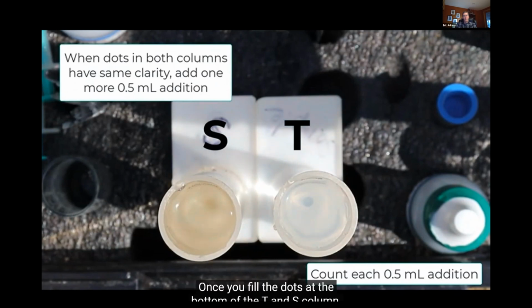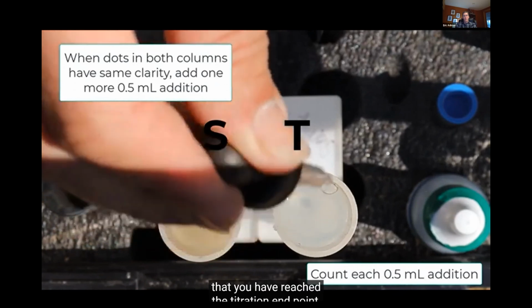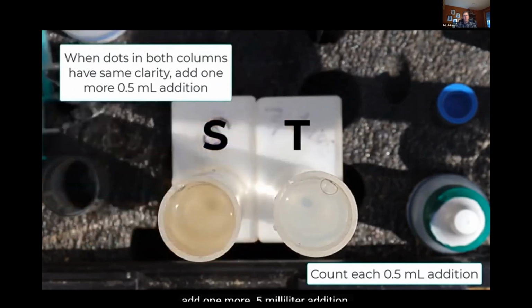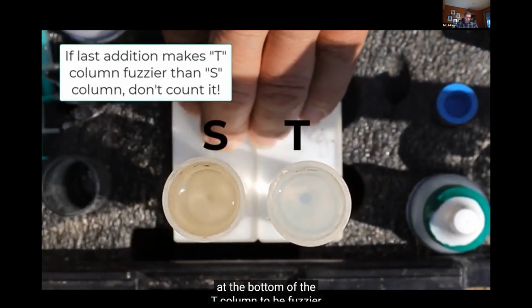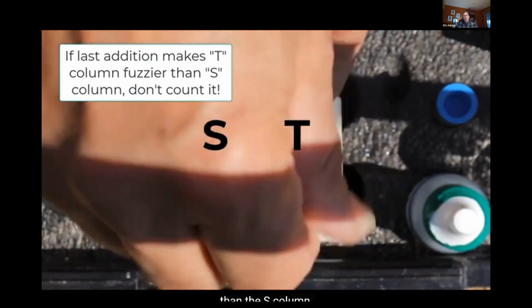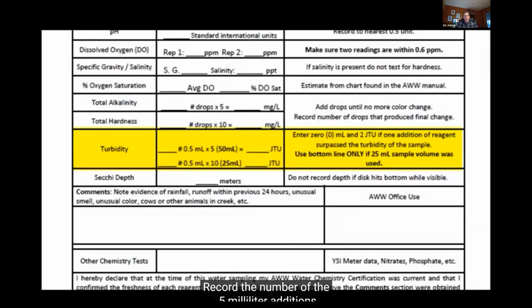Once you feel the dots at the bottom of the T and S column have the same clarity, or in other words that you have reached the titration endpoint, add one more 0.5 milliliter addition. If the last addition causes the dot at the bottom of the T column to be fuzzier than the S column, it confirms that the previous addition was the endpoint. Record the number of the 0.5 milliliter additions you added to the control, not counting the last addition.